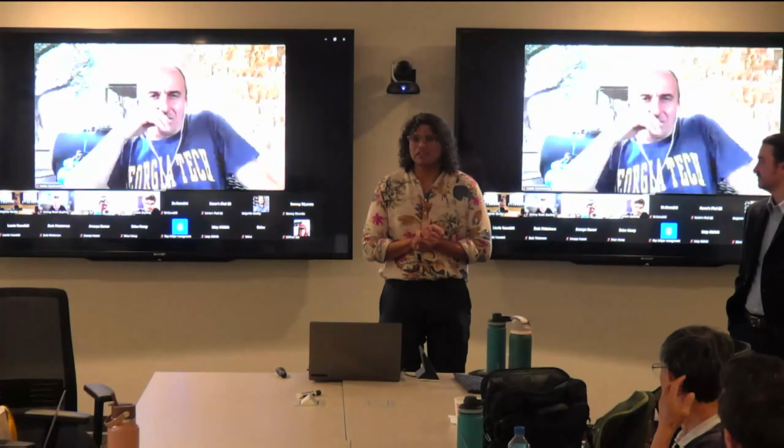So just to summarize everything we've talked about up to this point, we talked about the design of ARTiMiS and why it exists. We talked about some of the capabilities of ARTiMiS and how we validated its potential to take accurate measurements. And we demonstrated potential to discriminate objects, both synthetic samples and also real biological samples. All right, so up next, we're going to start looking at how we can use this in a wastewater treatment process.